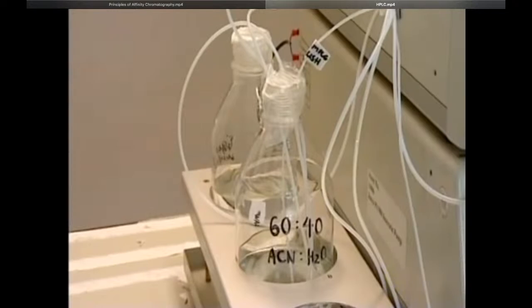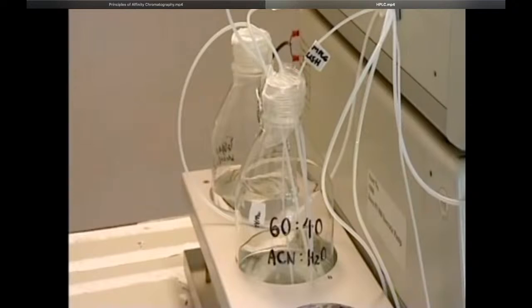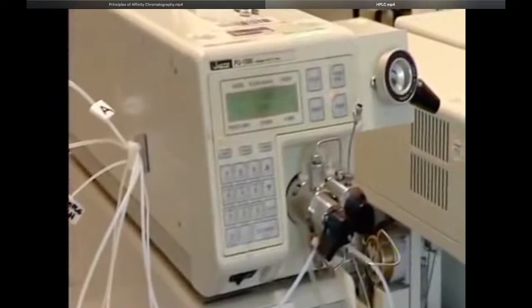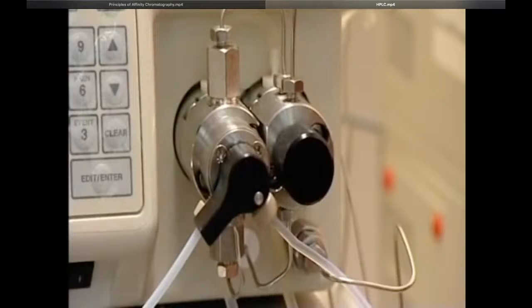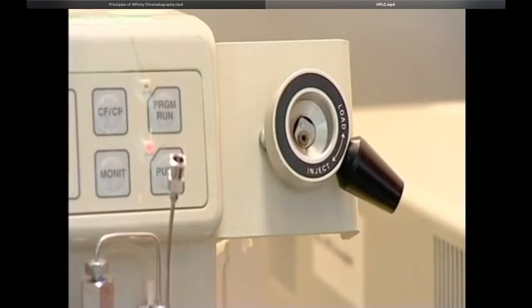The operator can decide on a mixture with the correct polarity for the separation she is doing. These are the pumps. They produce a pressure of 15,000 kilopascals, 150 times that of the atmosphere, hence the name, high pressure liquid chromatography. If a single sample is to be run, it is injected into the solvent stream here, in the injection port, via a hypodermic syringe.